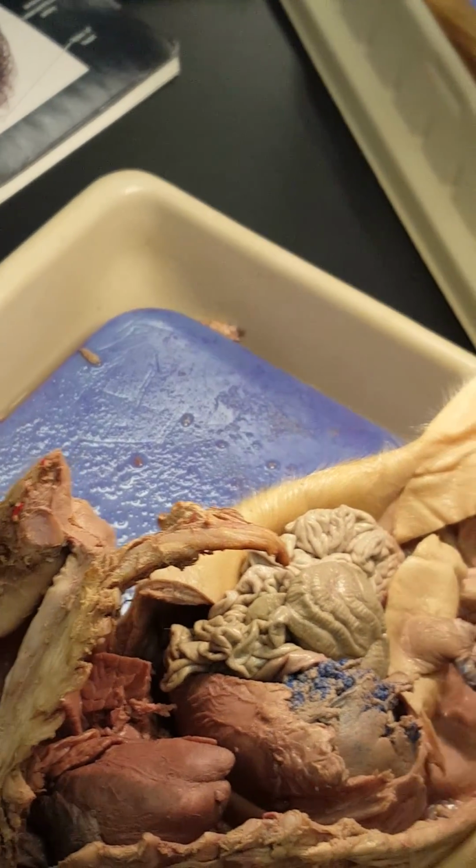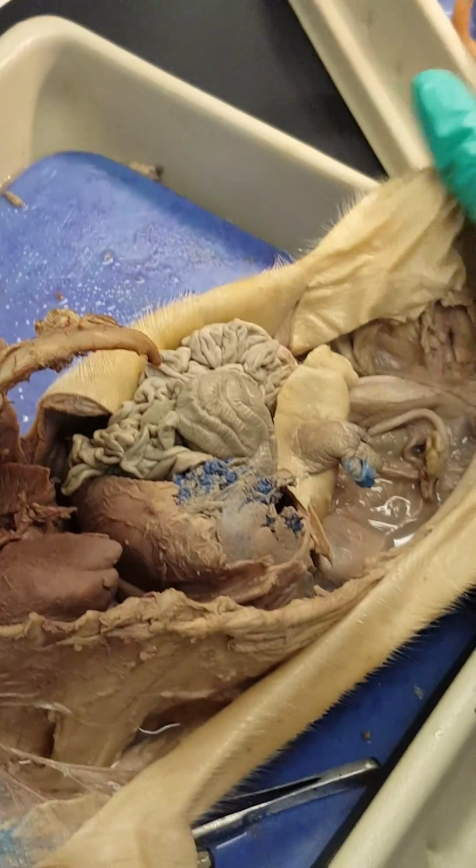Well, let me show one more thing here. If we look at our male, here's the testes down in the scrotum.